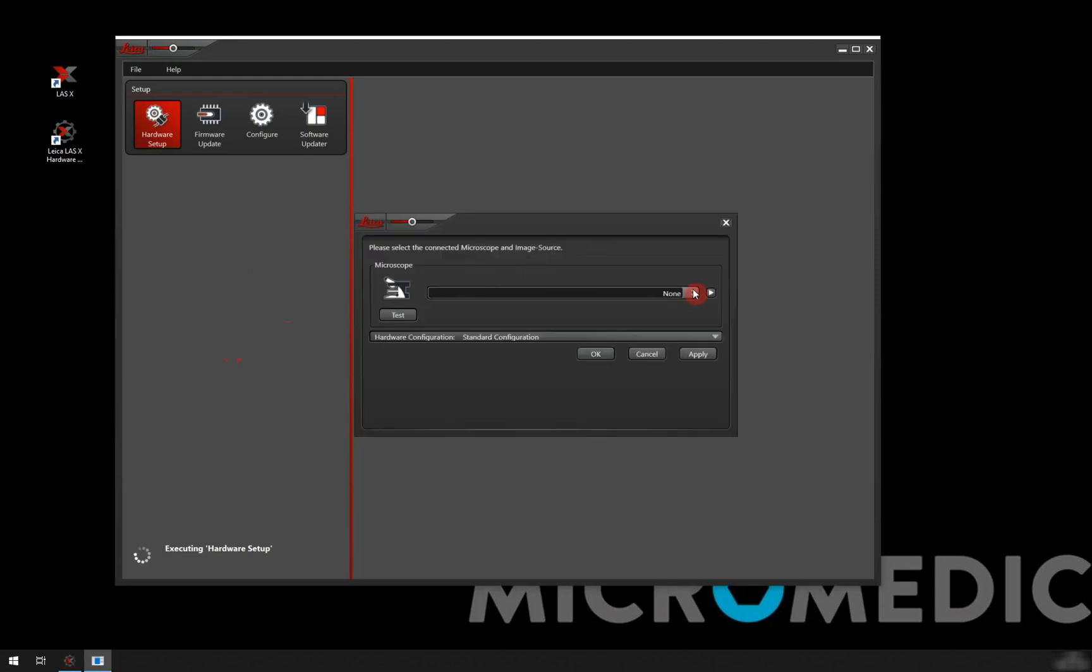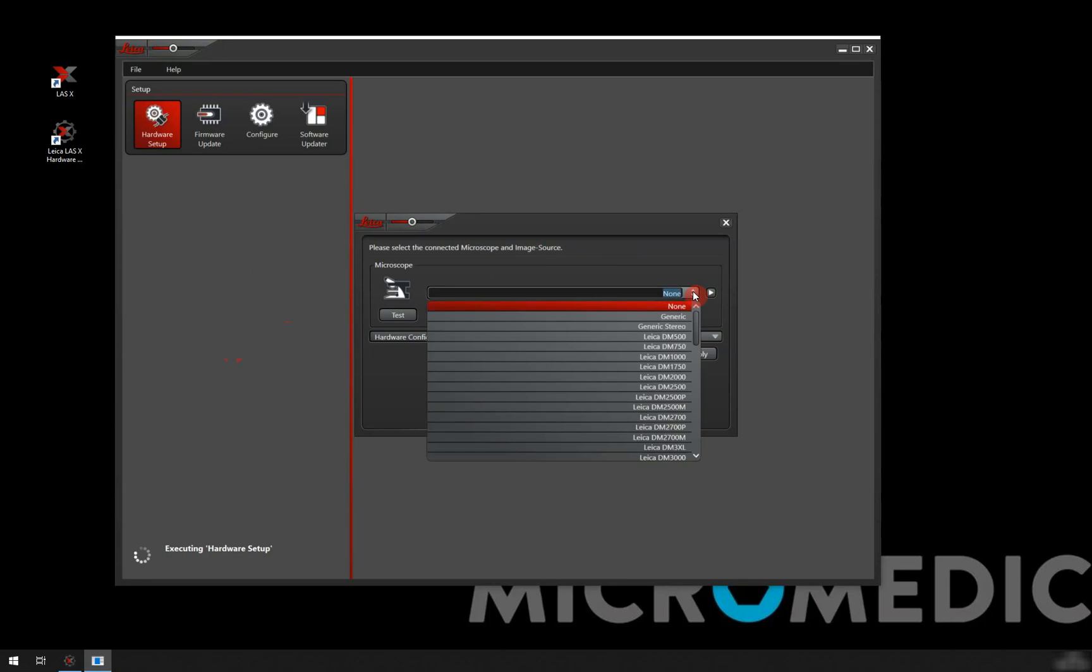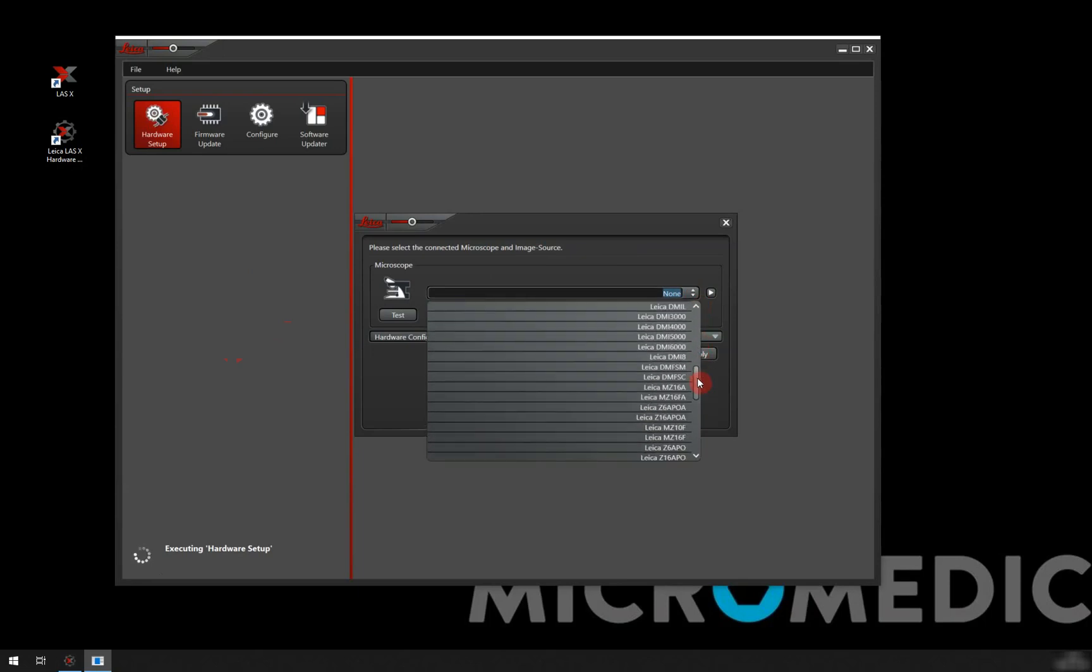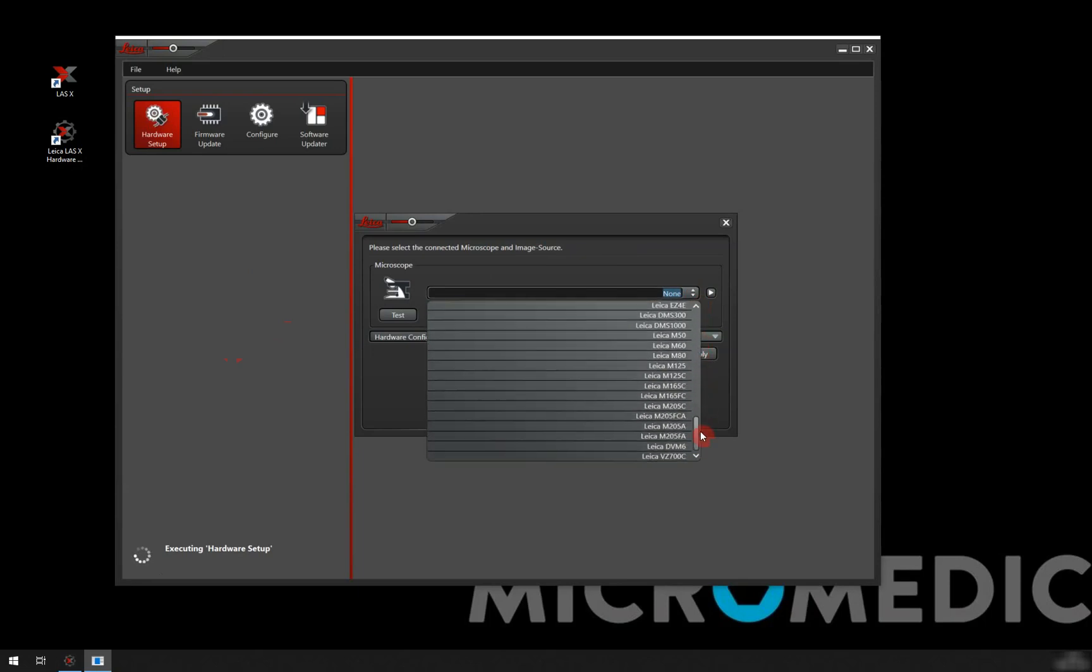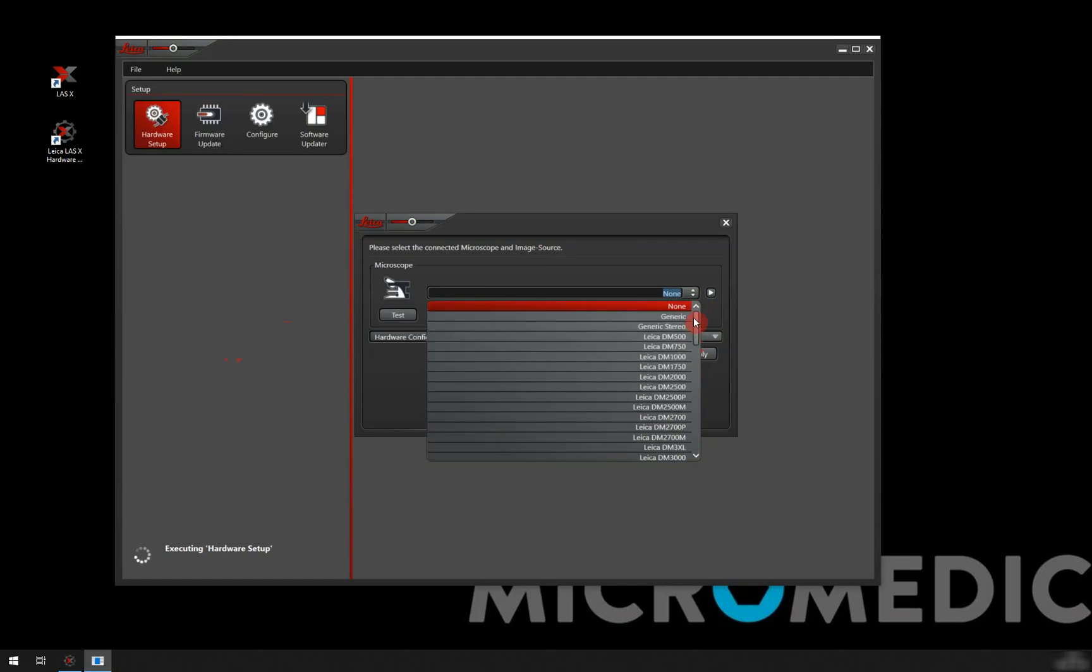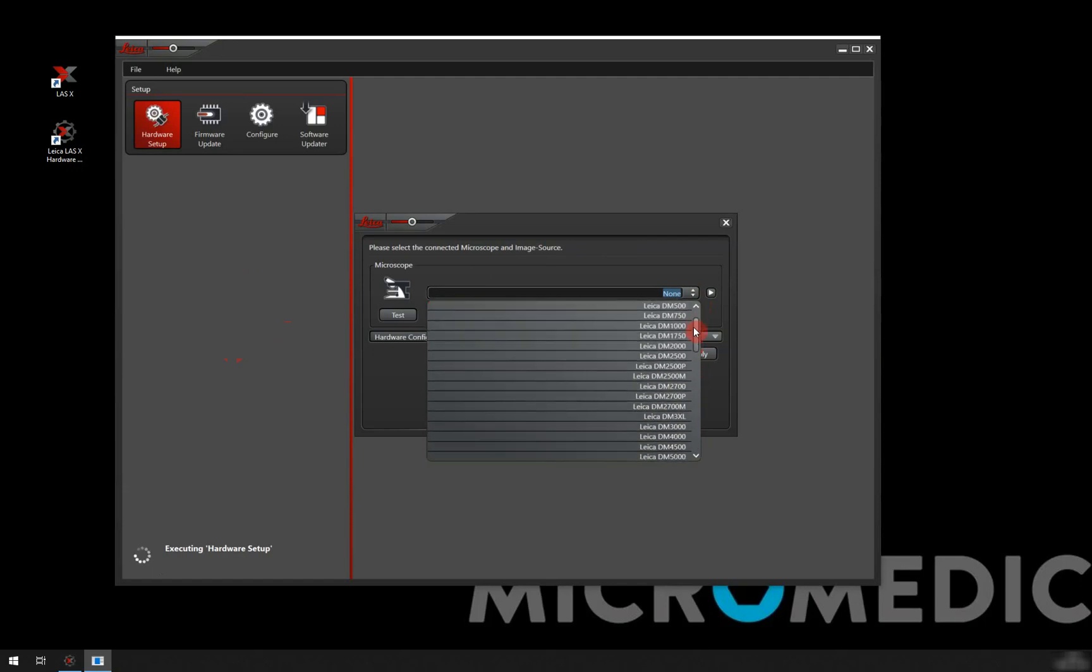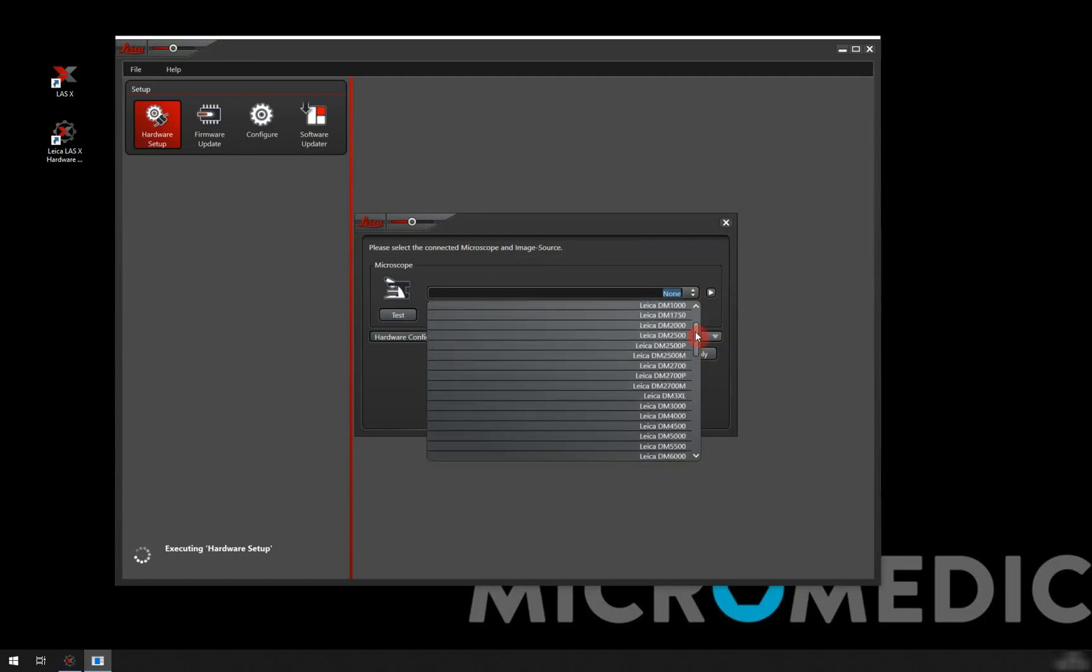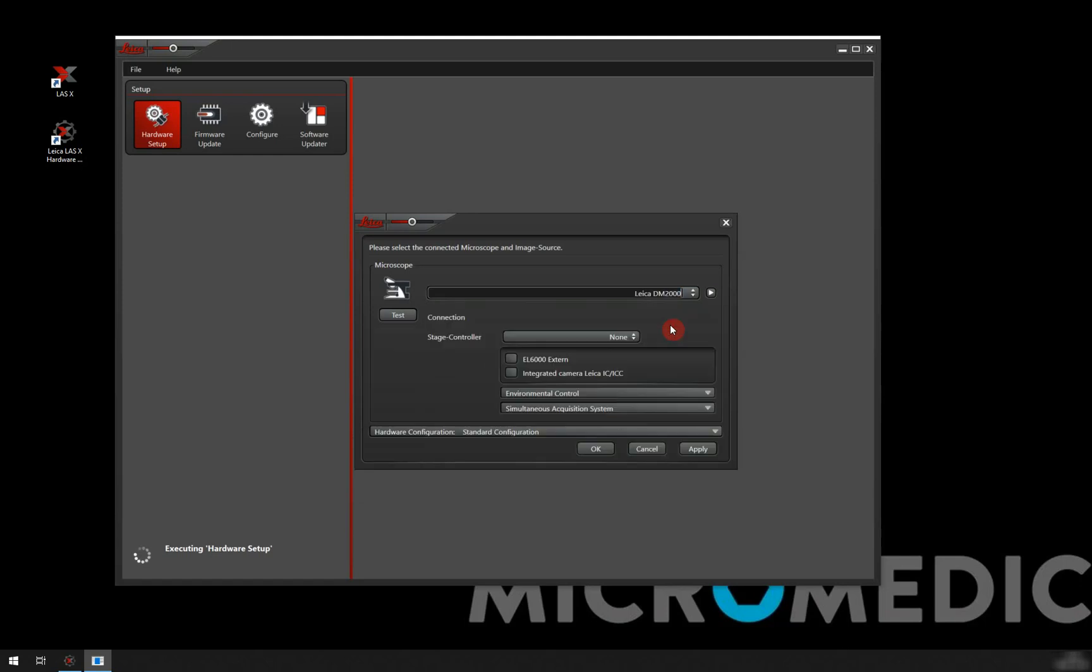We go into here and have a look at this drop down menu. We can see that we have a range of Leica microscopes here. We're just going to go through it and try to find the one that fits our model. In this case I'm going to choose the Leica DM2000.